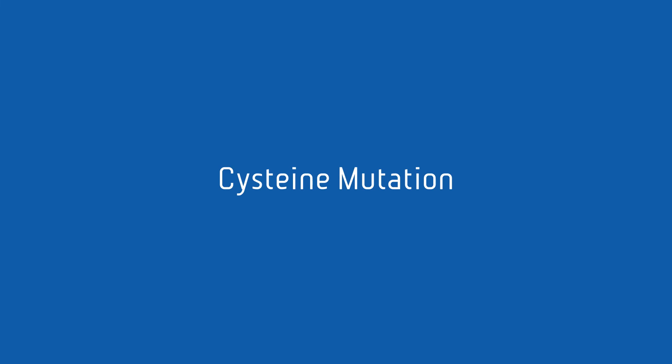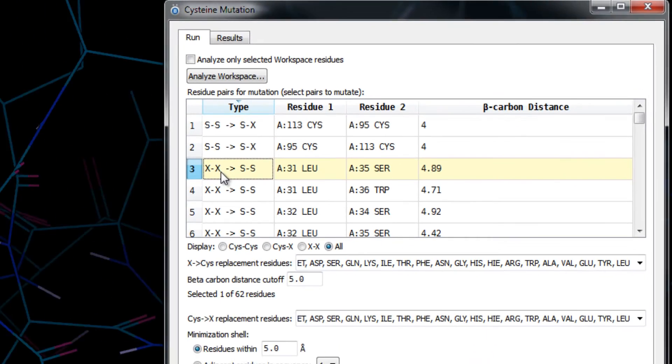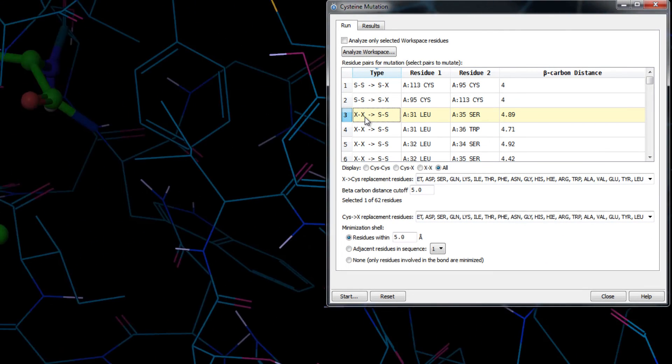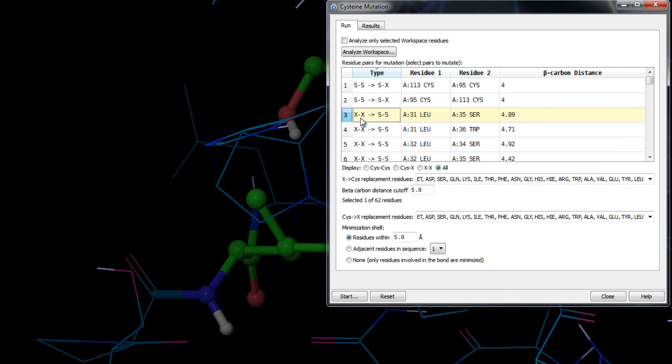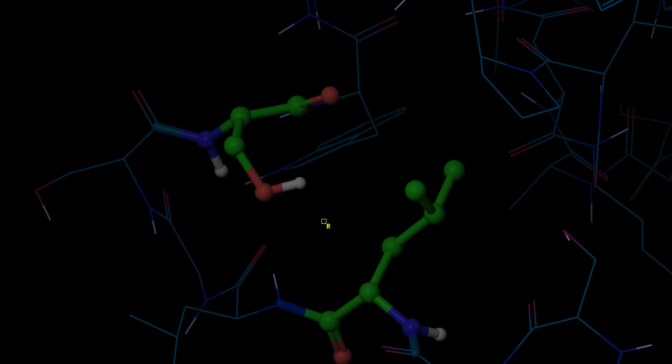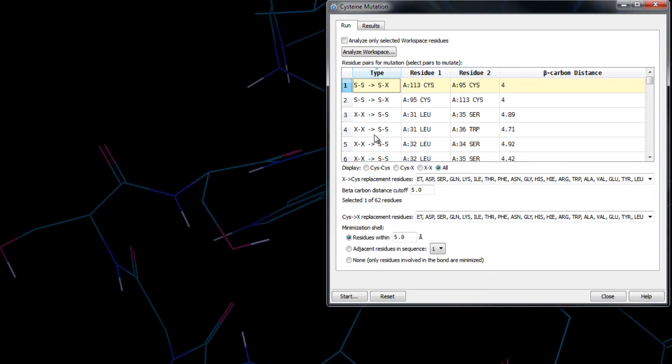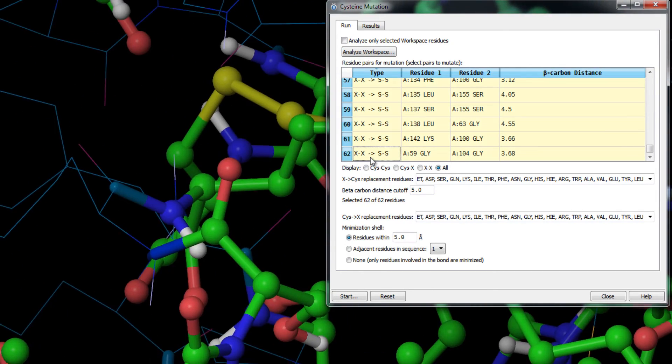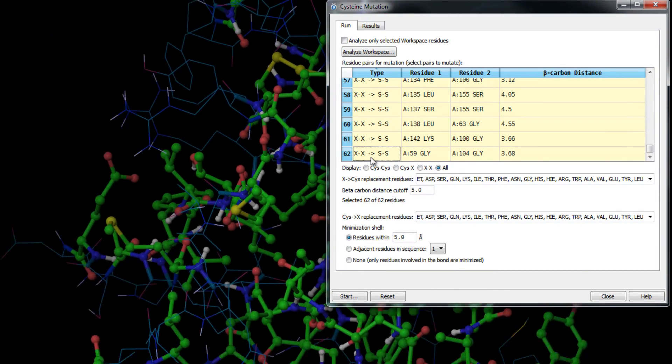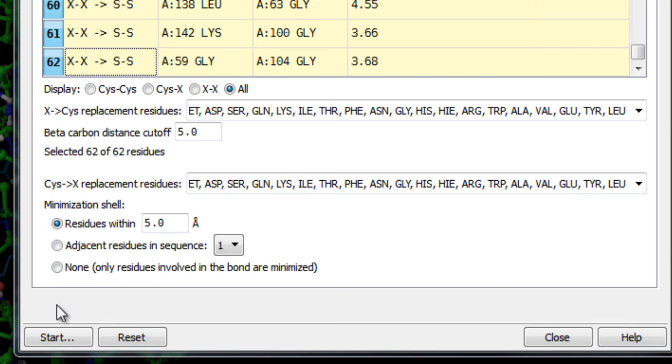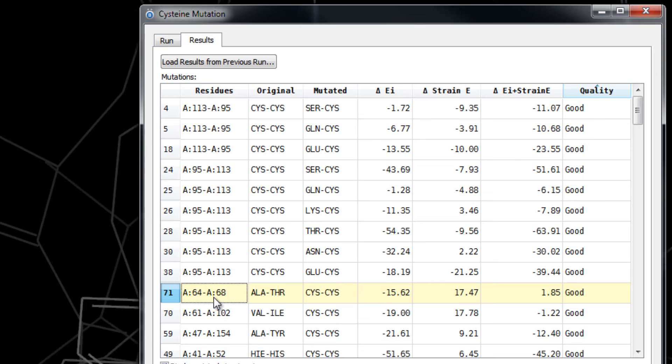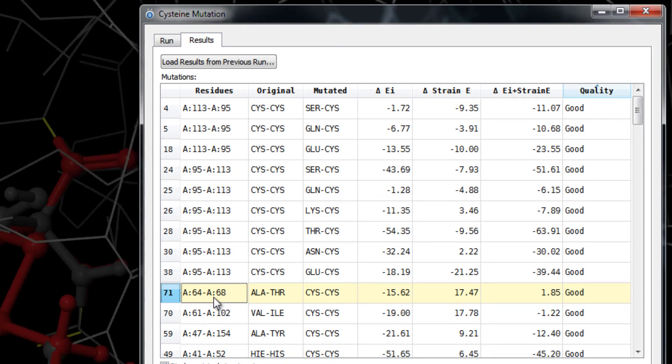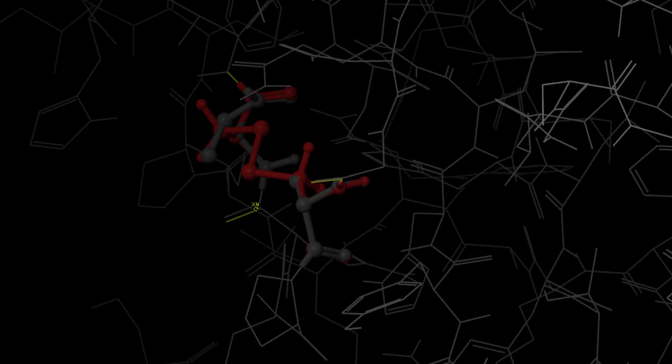Mutate residues to form or break disulfide bridges as a way of controlling the stability of a protein. Locate individual residue pairs or select all potential residue pairs within a given beta-carbon to beta-carbon distance, and mutate all pairs independently with one click. Then analyze and rank mutations and visualize the effect of the disulfide bridge on protein stability.